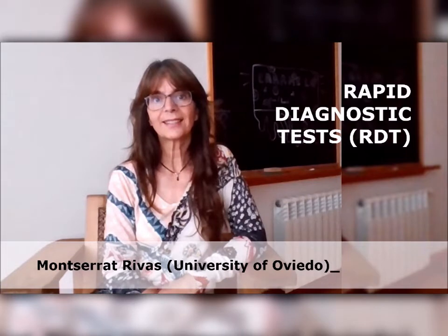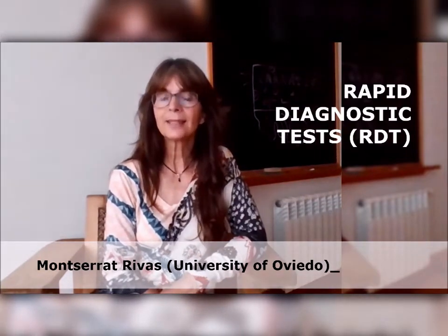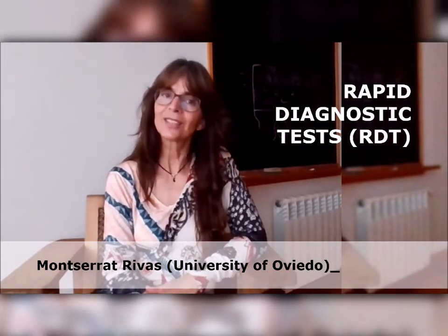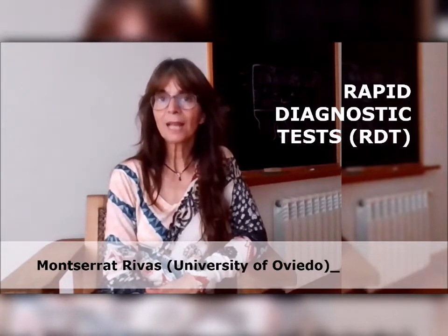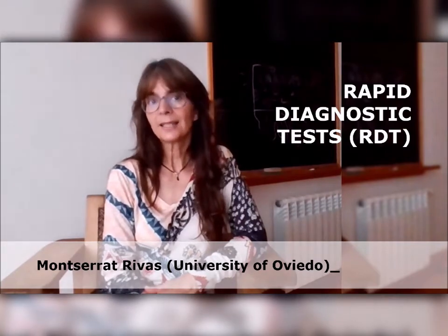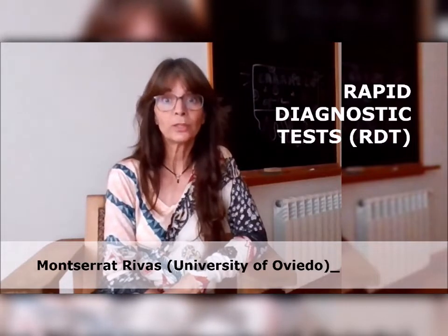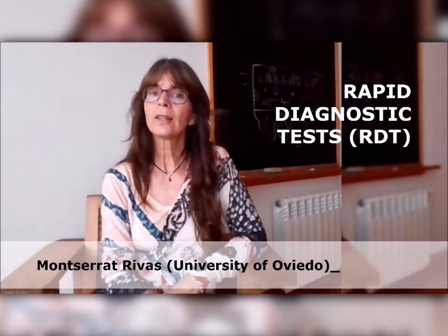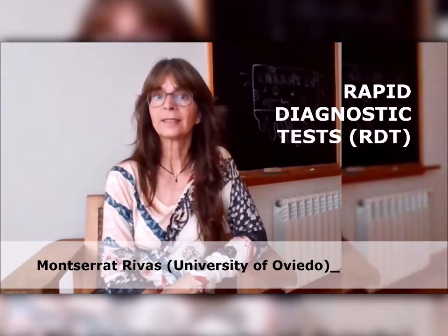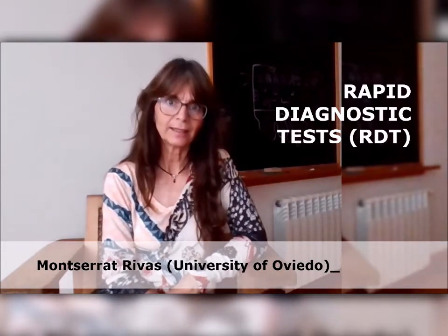Rapid diagnostic testing is one way to refer to devices to detect viral proteins or antibodies generated by the patient's immune system. That is the case of COVID-19. The same type of rapid tests are demanded to detect other biomolecules like cancer biomarkers or toxins that can be in fresh water or foods or beverages. The World Health Organization encourages research to improve rapid diagnostic testing. Then, how can we make this technique better?